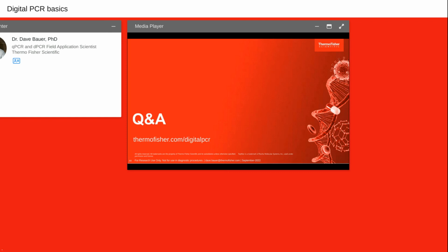And there's also another more sophisticated layer where the software isn't just looking at the overall intensity of fluorescence. It's also looking inside that image, the pixel by pixel intensity of fluorescence signal, that distribution of fluorescence intensity within the microchamber, and it knows that there's certain patterns that represent real PCR amplification versus perhaps an artifact. And so that's also used to make sure that things called as positive truly reflect PCR fluorescence, not artifacts.